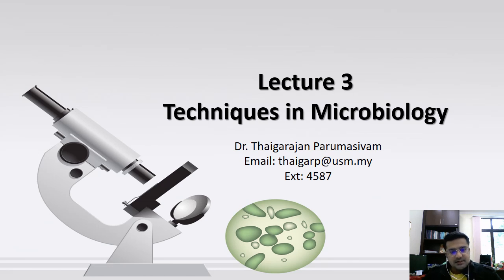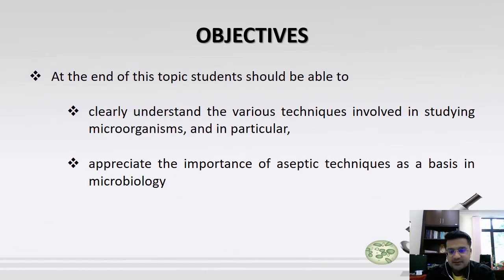Okay, hi everyone. So in the following consecutive 3 lectures, we're going to learn about techniques in microbiology. At the end of the topic, the student should have a clear understanding of the various techniques involved in studying microorganisms. In particular, appreciate the importance of aseptic techniques as a basis of microbiology. And some of these parts you'll also be learning in the practicals, especially practical one.